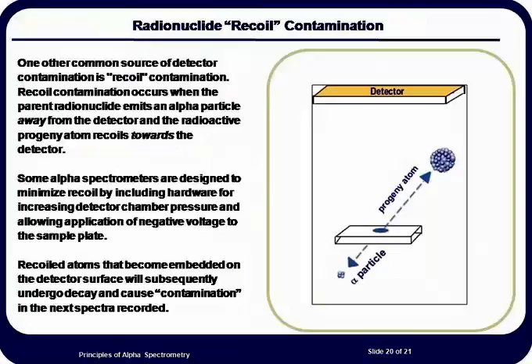Keep in mind that it is not only the radionuclide that was in the sample test source that will contaminate the chamber, but also any progeny of the analyte. Thus, contamination can last a long time and appear at many different energies. Another source of contamination is the possibility of the analyst himself or herself touching the insides of the chamber or the detector and creating cross-contamination from other samples or from the original sample.